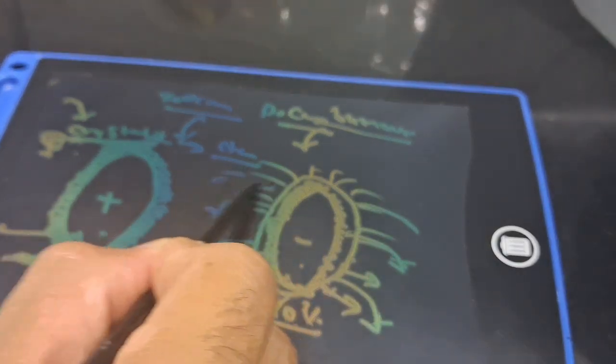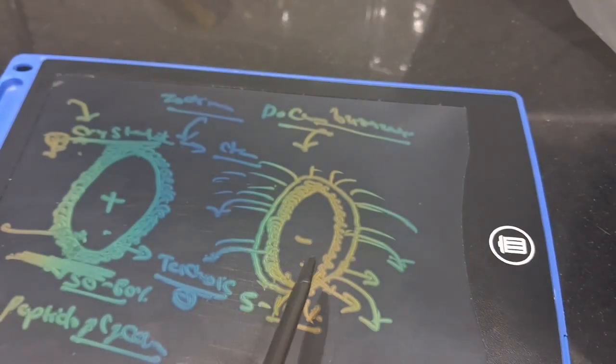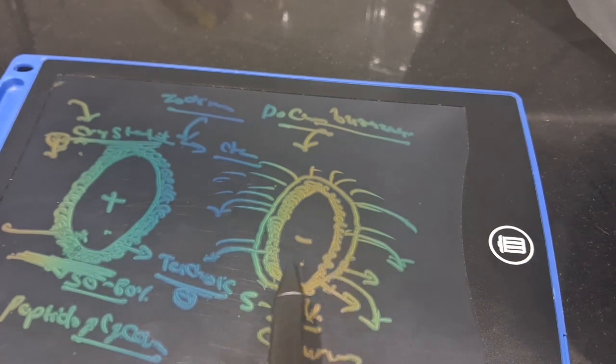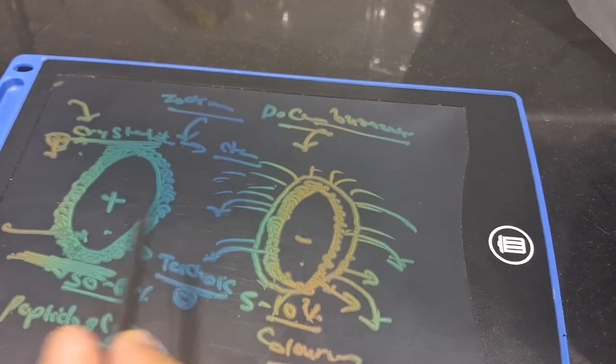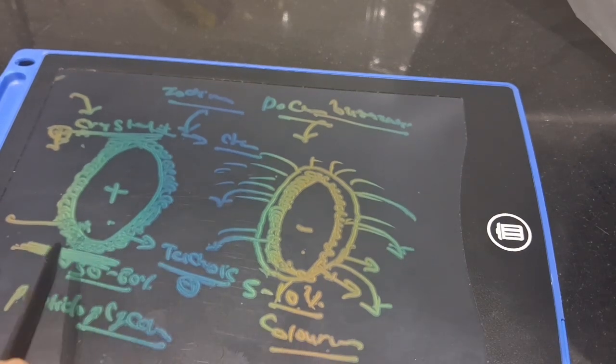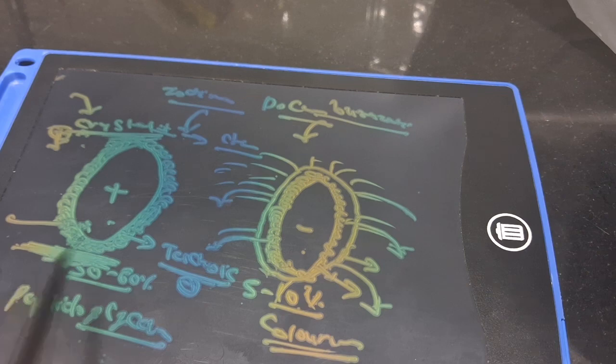It will be released, okay? So after decolorization, you will see that gram negative are looking colorless. Why is it looking colorless? Because of the acetone, all the chemical complex of crystal violet and Gram's iodine which was present inside the thin layer of peptidoglycan has leaked out. So after the decolorization, you will see that it is colorless and the gram positive is still purple.